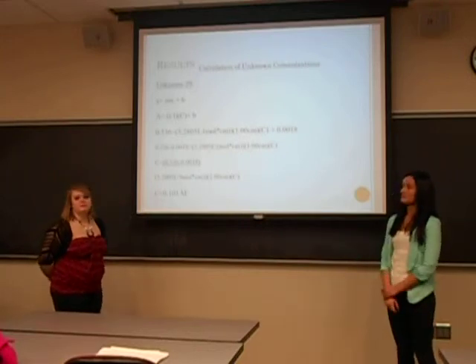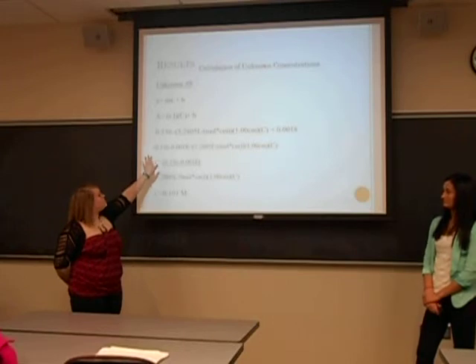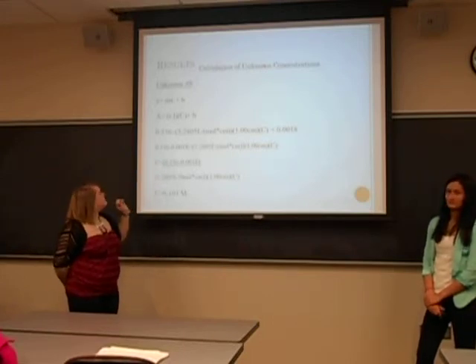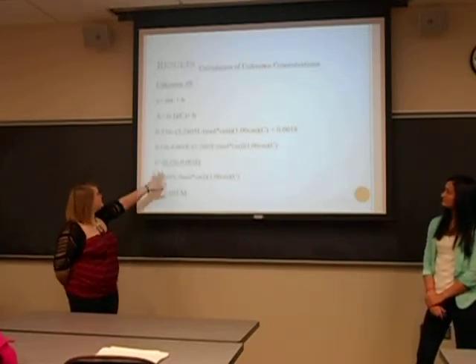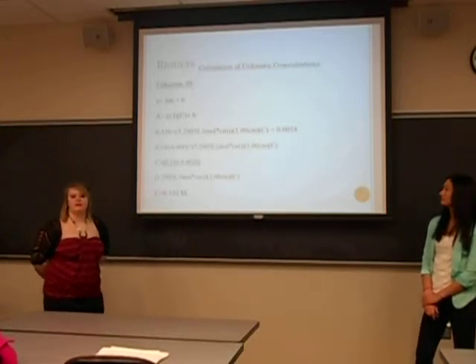So here's unknown 9, and it's the exact same steps as she did, except the absorbance is different. Unknown 9 was 0.536, so we plugged it in, and the concentration is 0.101 molarity.